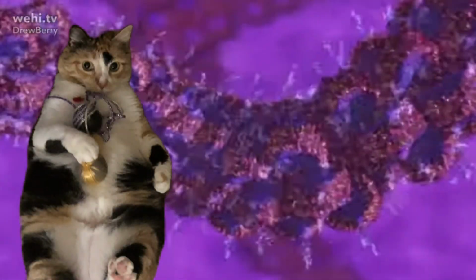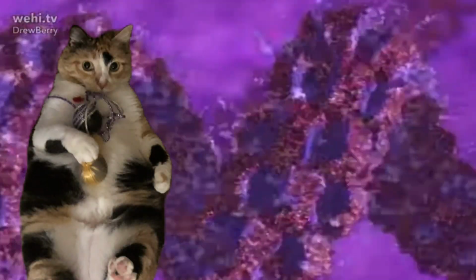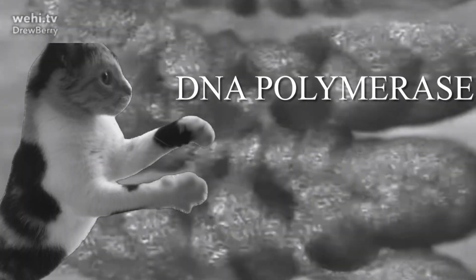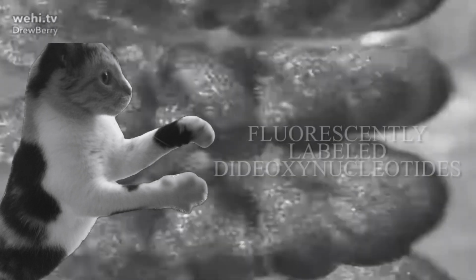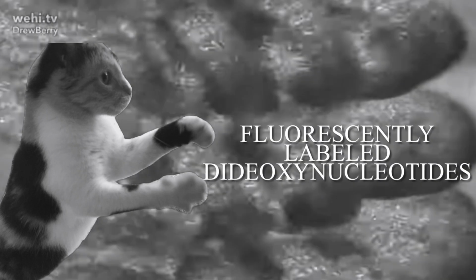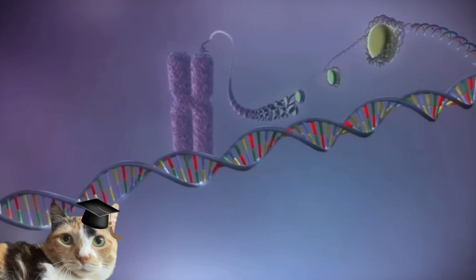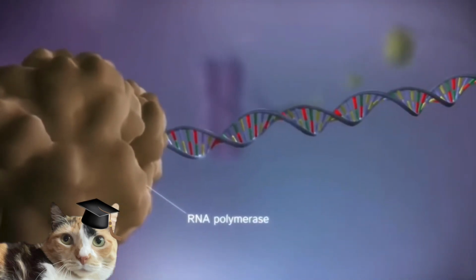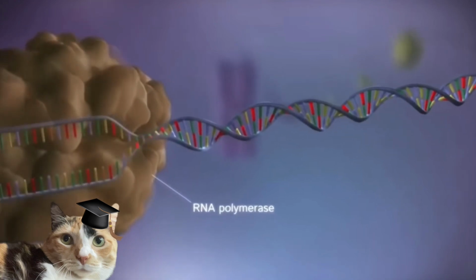The process of Sanger sequencing includes these key components: template DNA, nucleotides, DNA polymerase, a primer, and fluorescently labeled dideoxynucleotides. First, the DNA is denatured, meaning that it changes from double-stranded to single-stranded, so the primer can easily attach to it.